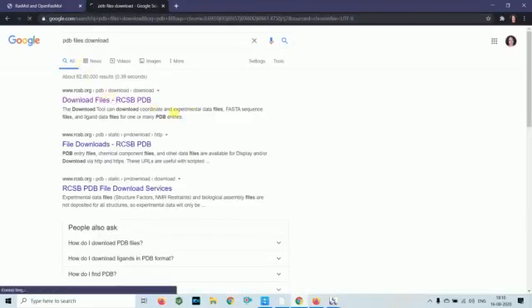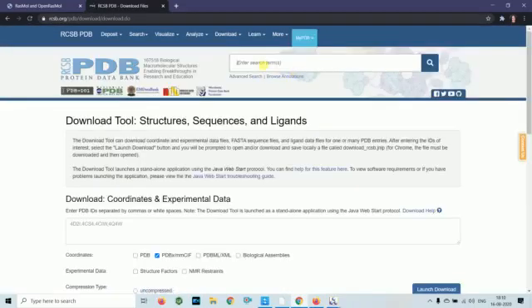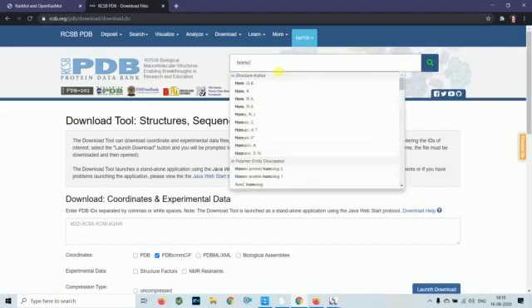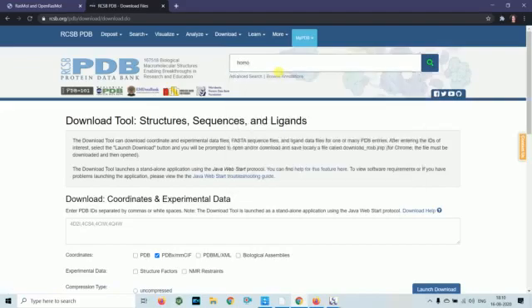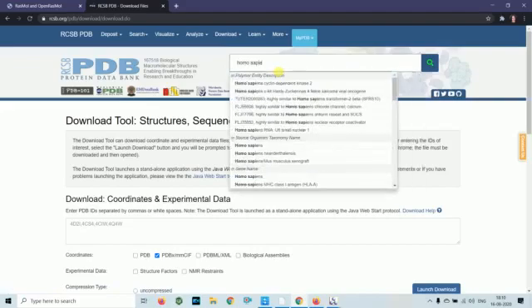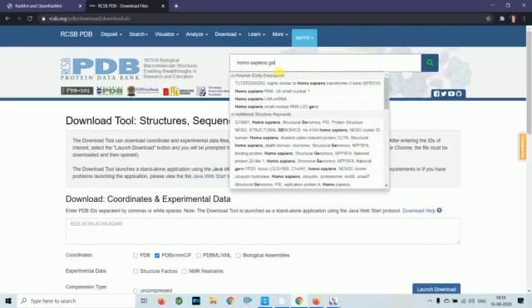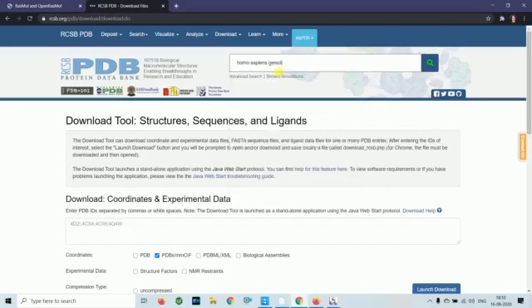Click on download files. Type the name of the protein structure you want. In this case, I am looking for Homo sapiens gelsolin.